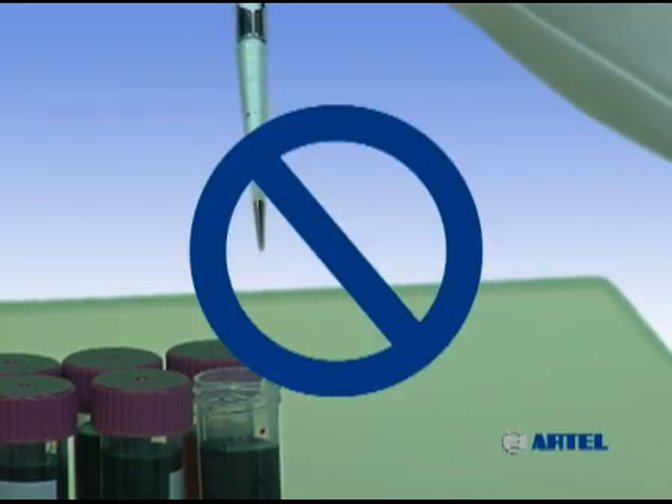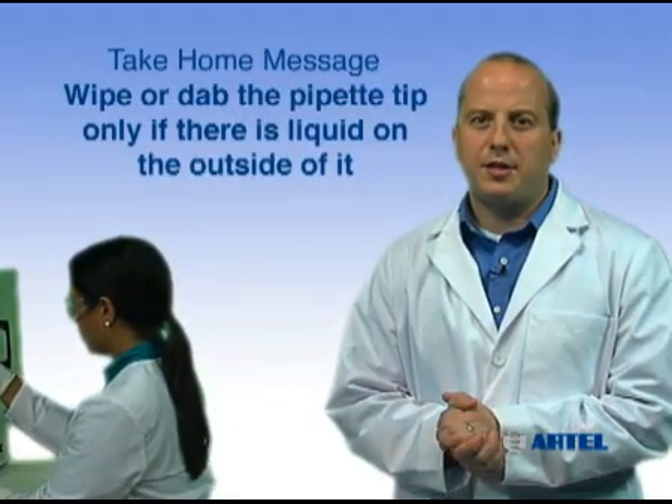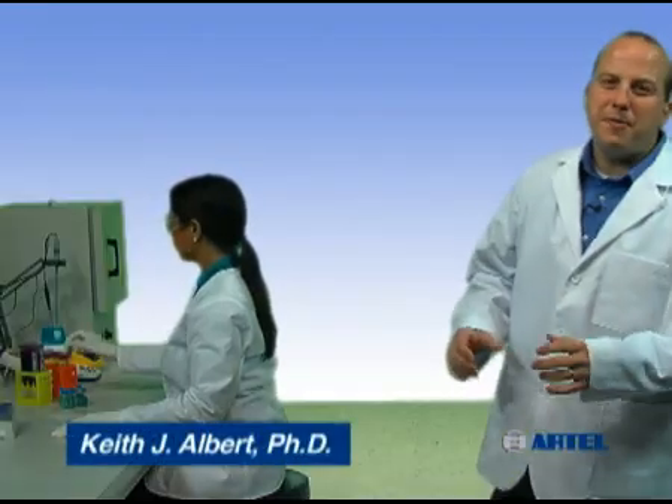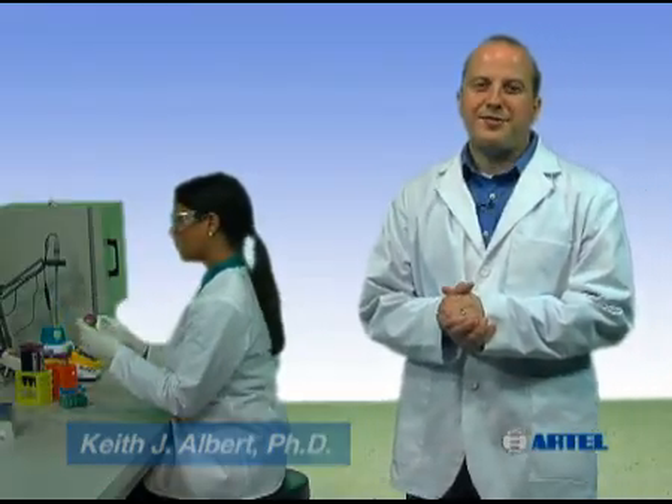The take-home message is: if there are liquid droplets on the outside of the tip, wipe or dab using a lint-free cloth. Avoid wiping near the tip opening. Using proper pipetting technique helps you ensure liquid handling quality so you can trust your assay results.